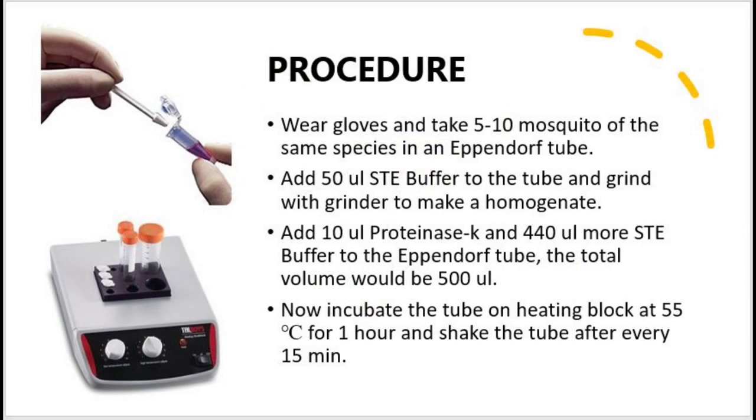Add 50 microliter STE buffer to the tube and grind with pestle mortar to make a homogenous mixture. Then add 10 microliter proteinase K and 440 microliter more STE buffer to the eppendorf tube and again grind with the pestle mortar as shown in the figure.